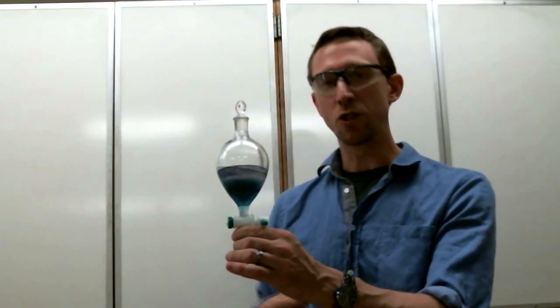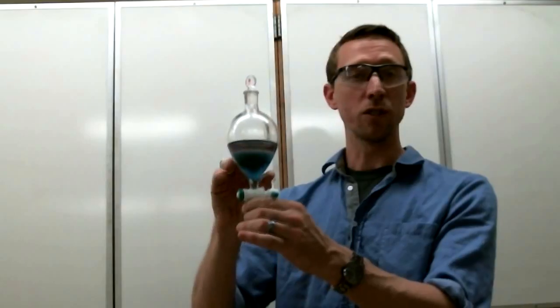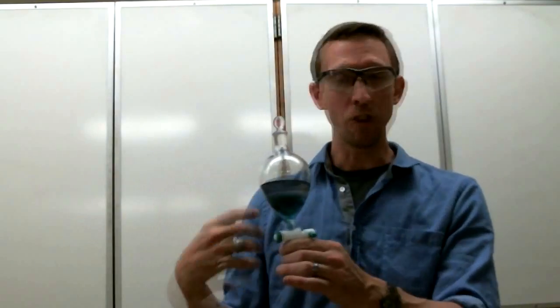And we can use this trick to separate not only molecules from one solution and move them into another, but different molecules in solution from one another if they have different solubility properties. That's how it works, folks.